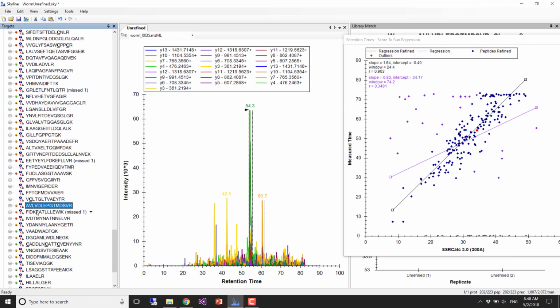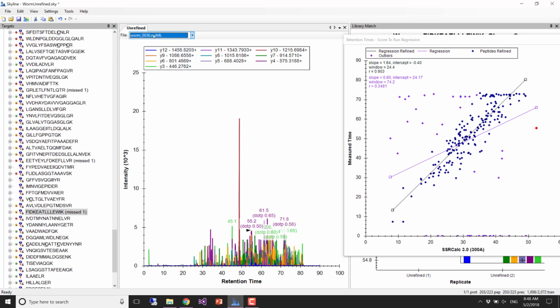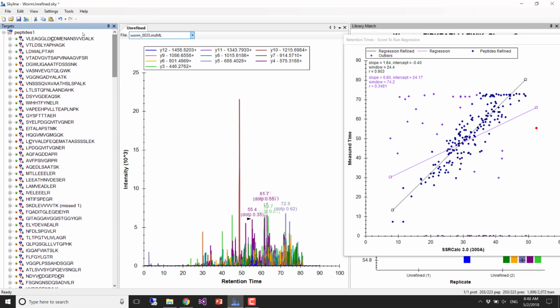And you can see that if you look at the peptides below the empty spot here, they got measured twice too. So in this case, 36 got measured twice. And so we didn't actually get measurements of everything.